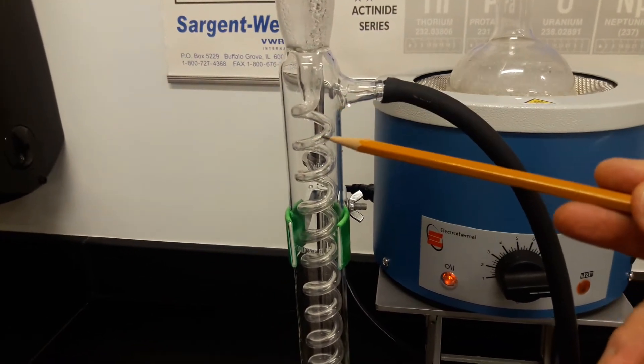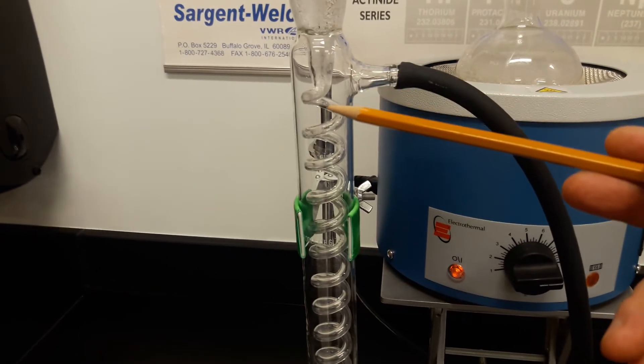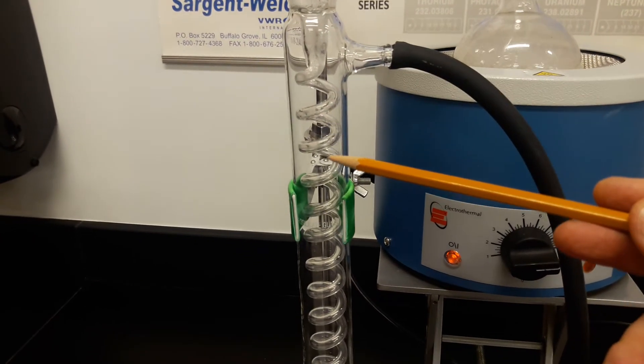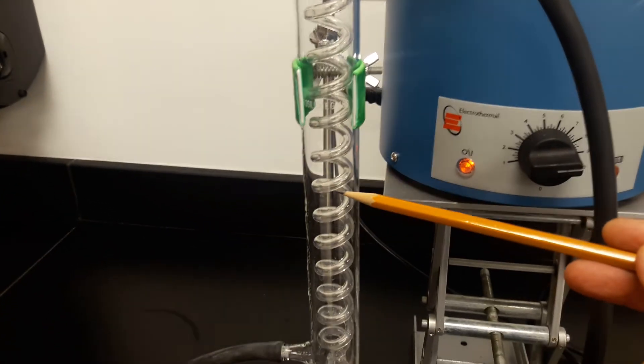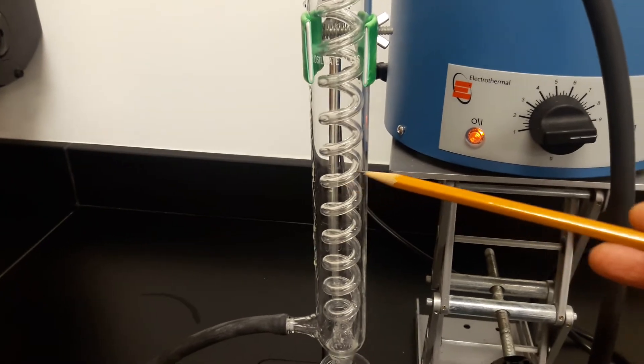into the condenser, but does not mix with the condensed material because it's in a separate glass spiral inside the tube.